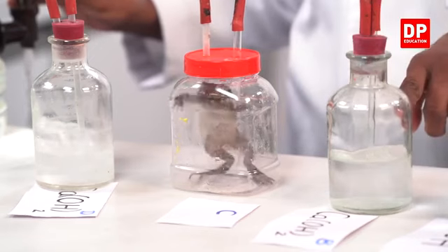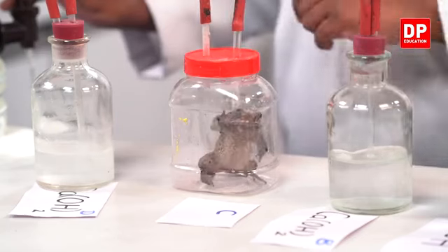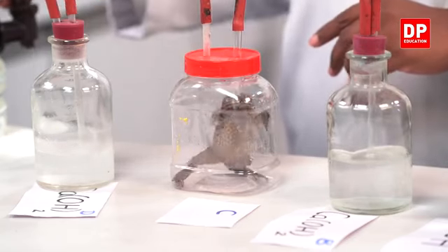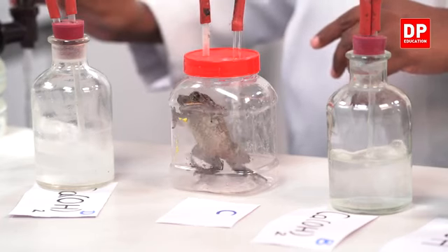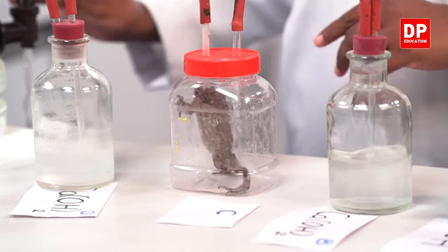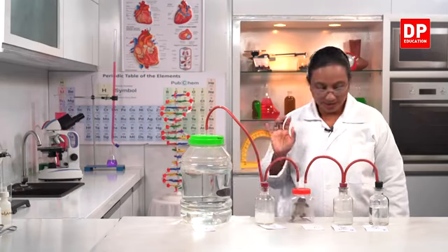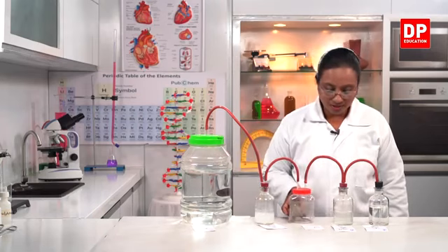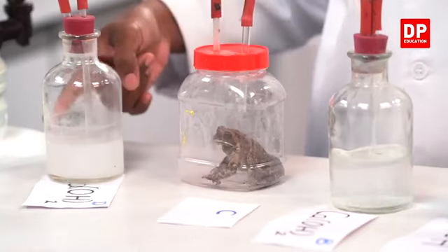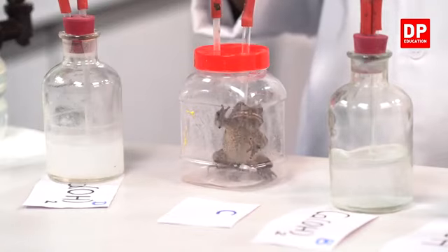Here you can see, students, there is no color change. Here you might observe a slight color change. You know what the color change is. Clear solution to a milky solution. So now here, students, you all can observe the color change. Look at this bottle. The color is still the same. It's a colorless solution. Look at this bottle carefully. You can see the solution has turned milky in color.